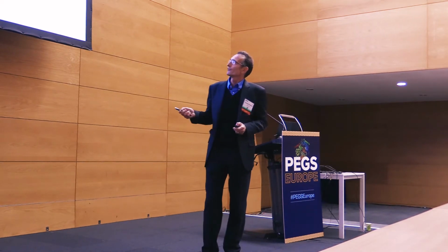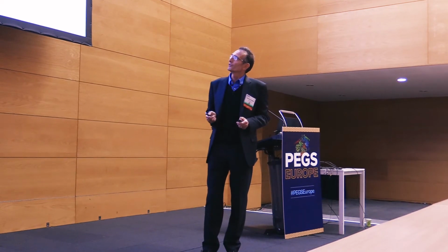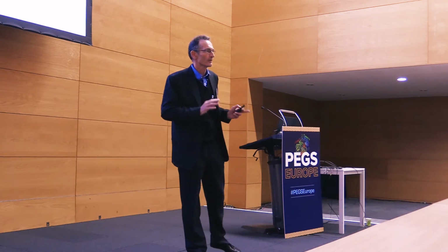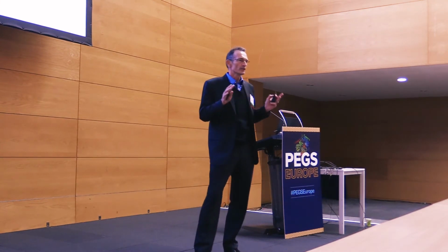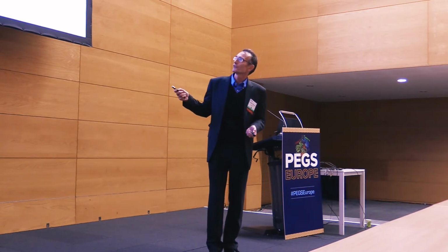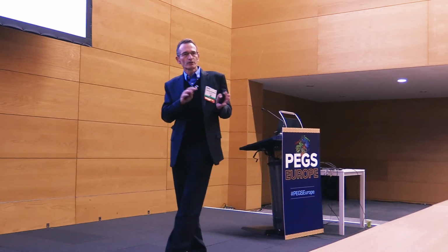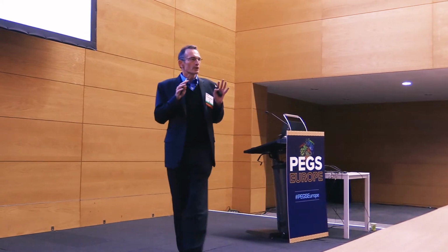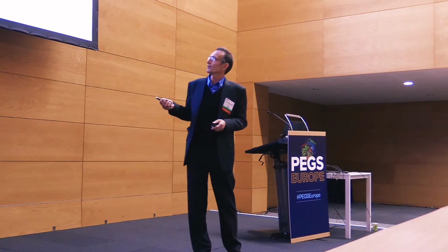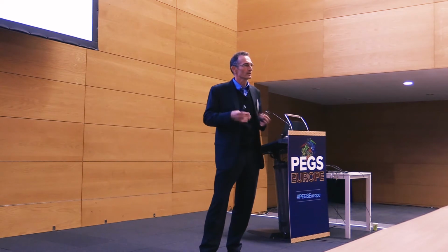So just looking at the general library design overview, what we are proposing, before we go there, a couple of definitions. You'll hear people talking about liabilities. There are essentially two sorts of liabilities, at least I'm going to talk about two here. The first is a sequence liability, and this is an amino acid sequence that is known to create potential problems. But because it is known that it will create potential problems, it doesn't mean that it will always create the potential problems. It's a theoretical liability, and it may not be a liability within a particular sequence context.